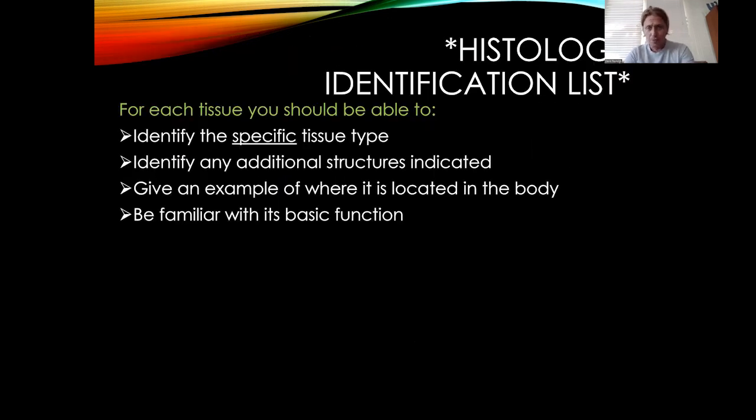Okay, so one of the things that you will need to do in lab when we meet up next week is be able to identify all these different types of tissue under a microscope. I'm going to give a quick breakdown of how to use a microscope when we meet up. But after that, it's up to you to just look at the slides, make sure you can identify it for the practicals in the future, and then be able to answer any of these facts about this tissue.